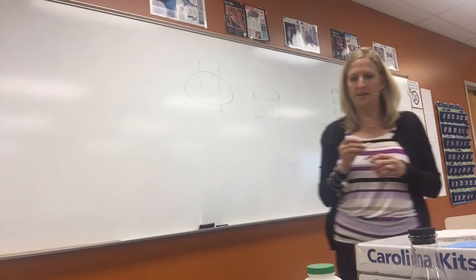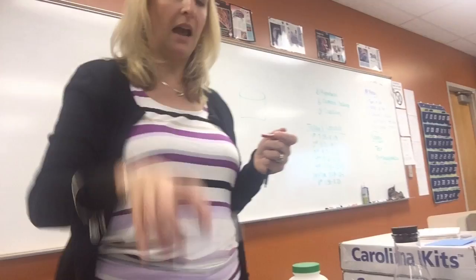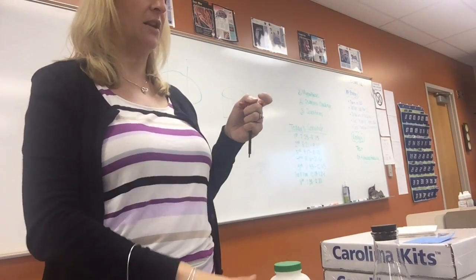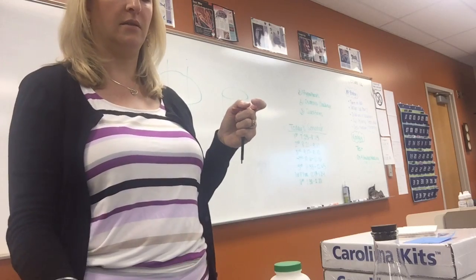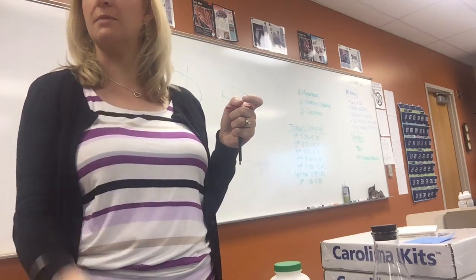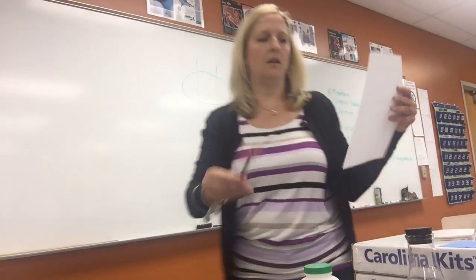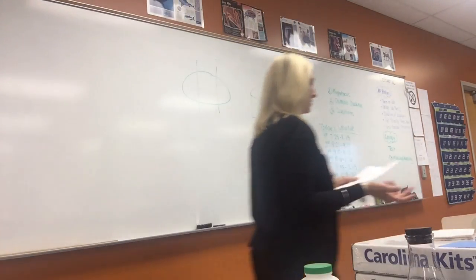And then we'll have massing cups available. That's these little guys here, because you're going to mass potatoes. Instead of putting it on the scale itself, you'll use these massing cups. Okay? So those are the things that you'll have available to you.